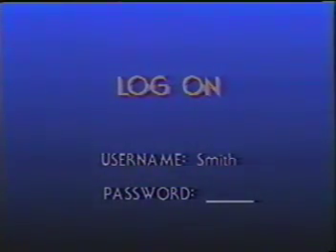To use FACS, you must first turn on the terminal and log on to the computer. Your system manager will assign you a password and show you the proper logon procedure. When you log on to your terminal, the cursor appears next to a prompt, such as the $ shown here. To enter FACS, type desk and press return.